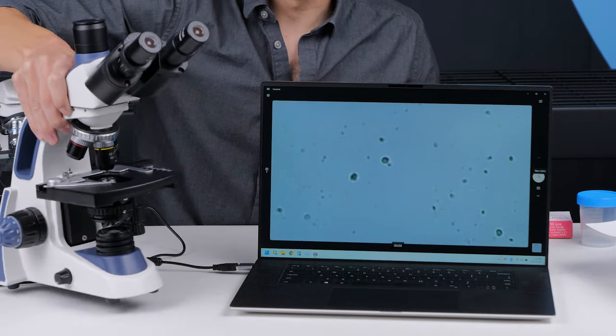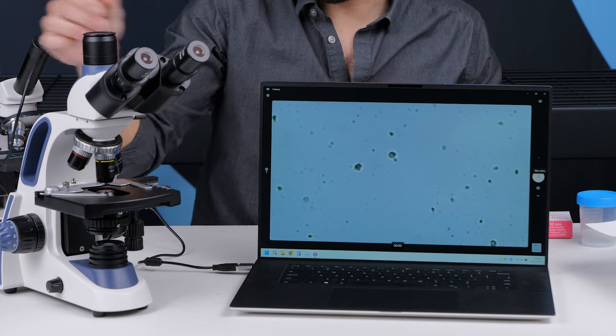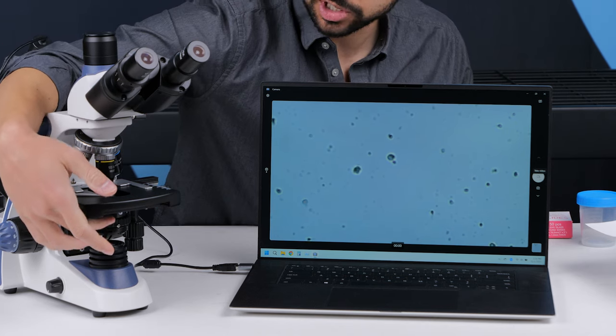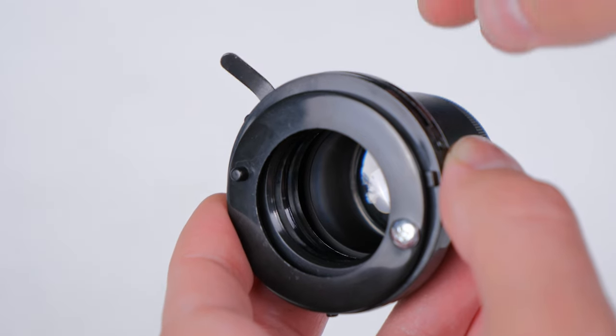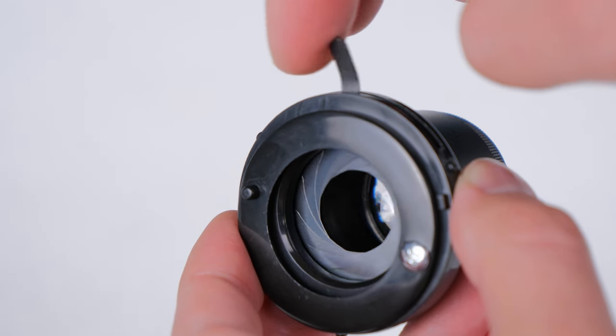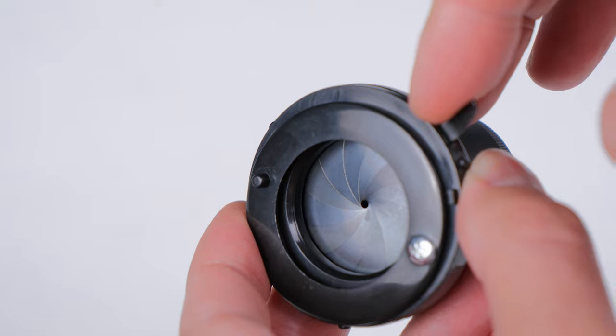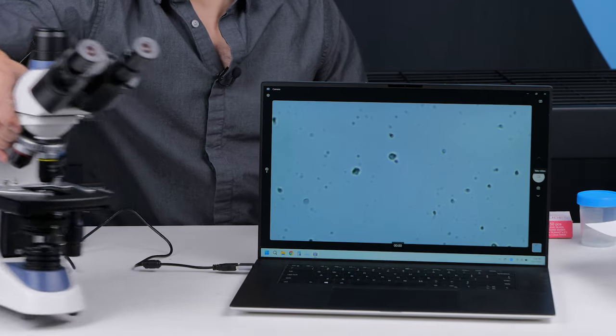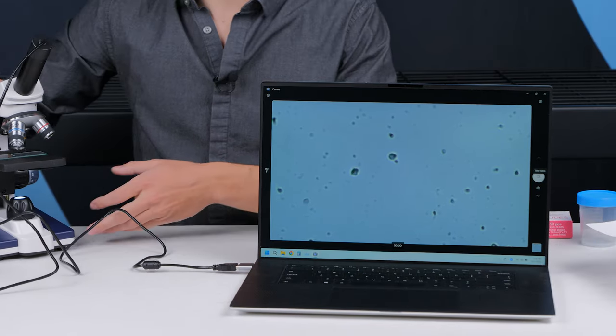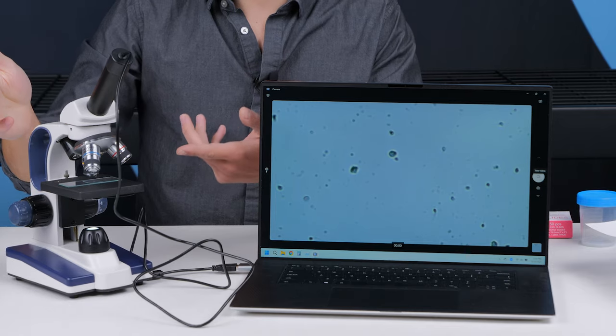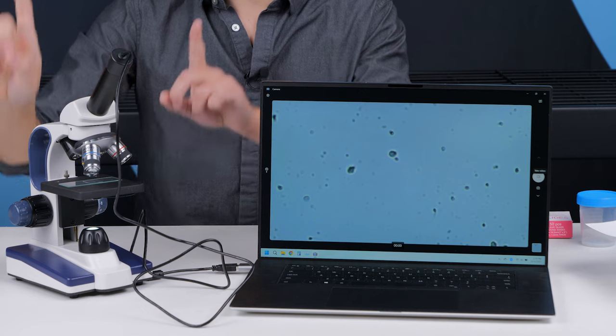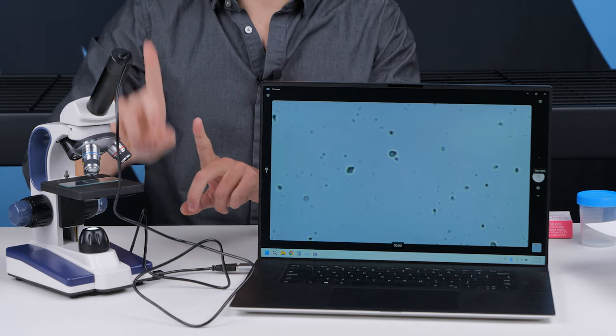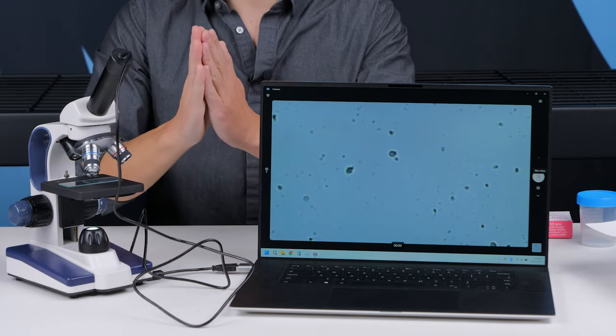It's worth pointing out that if your microscope has a condenser on it, such as on the Horizons microscope, the condenser is down under here, you're going to need to close the aperture diaphragm of the condenser all the way down, which essentially ends up giving you the same illumination system as this microscope has, which is even without a condenser. You really need that light to be straight up, hitting the sample at very direct right-on angle.